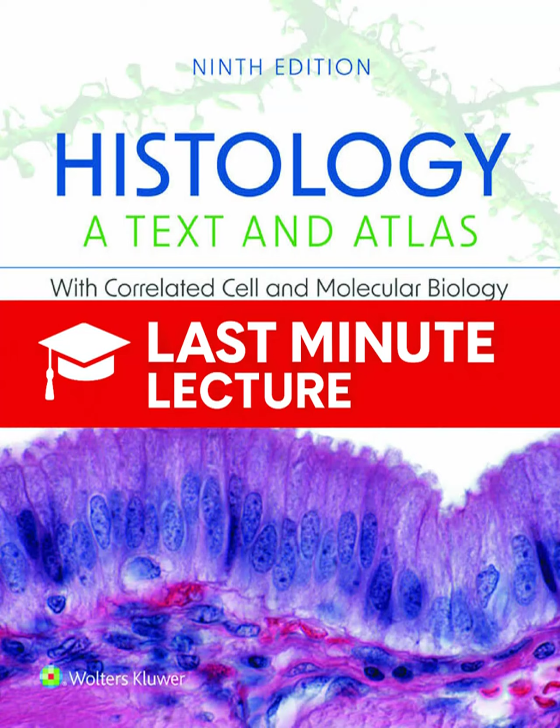You want to open the condenser diaphragm, the illuminating aperture, until it covers about 2/3 of the objective aperture. If you open it too wide, your contrast plummets. If you close it too much, you get better contrast, but you start to introduce ugly artifacts like diffraction rings. 2/3 is the sweet spot.